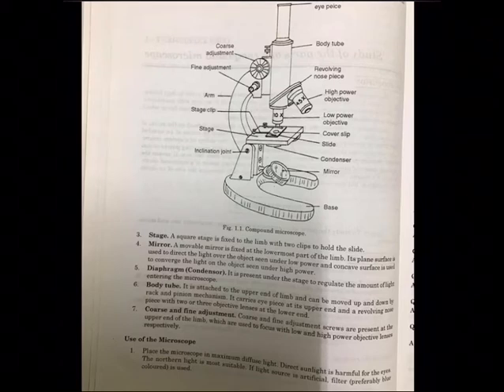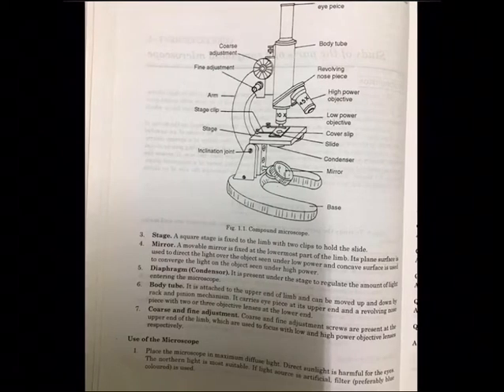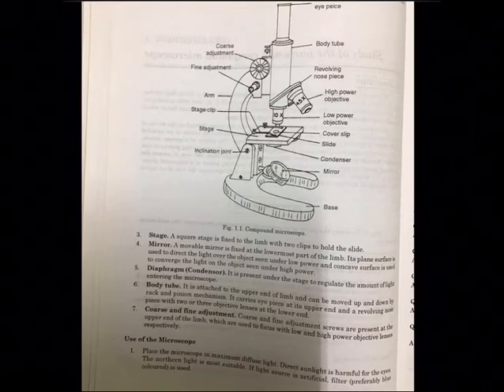Place the slide on the stage and adjust the object just over the stage aperture. Locate the object and focus it with a low power objective using coarse adjustment. If higher magnification is desired, turn the nose piece to the next higher power. So you can always rotate that disc. And when you rotate the disc, how do you know that it is fixed properly? There will be a small sound, a tuck sound. So you must hear that sound. Once you hear the tuck sound, that means the objective lens is fixed.